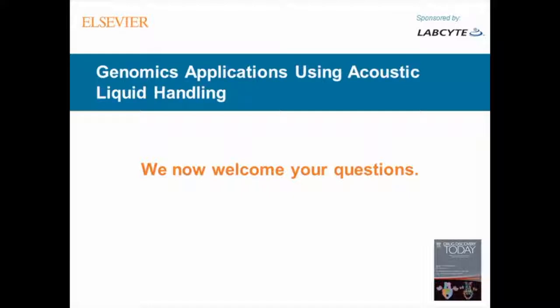That's a tricky question. Barcode hopping has really come up recently, and my understanding of it is that it's a bit of a contamination issue with the ExAmp chemistry for some of the Illumina readers. I believe Illumina has a white paper, and I would point you to that for addressing most of those questions. In terms of the Echo and what we can do to help, it's essentially a cleanup question, and the bead cleanups are very good. One thing that we've been thinking about is utilizing some of the enzymes, ExoSAP, or some of the enzymes from ArcticZymes, say, to help get rid of some of the smaller fragments, barcodes in this case, that remain post-cleanup.